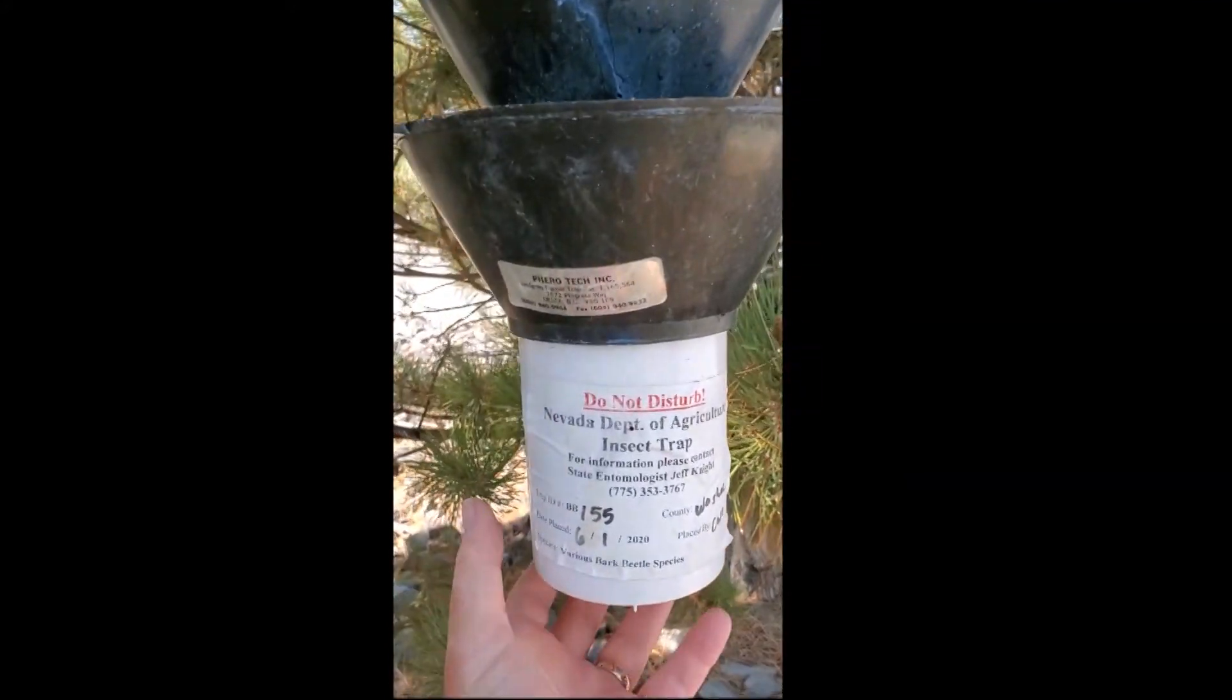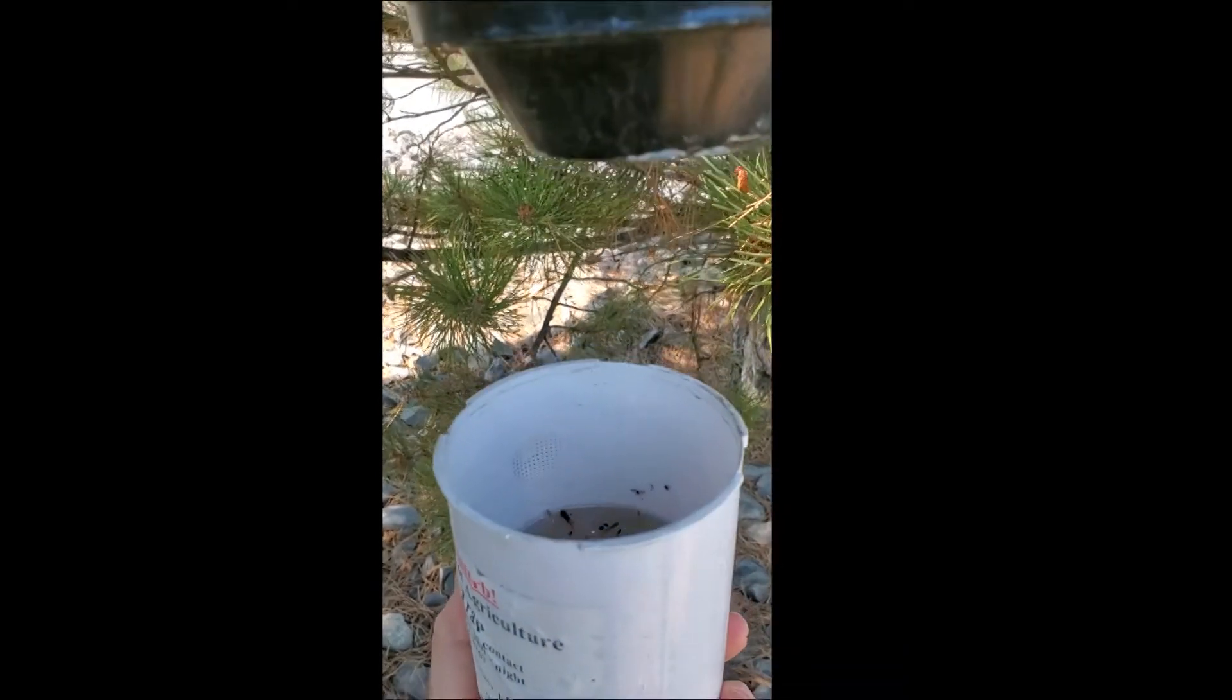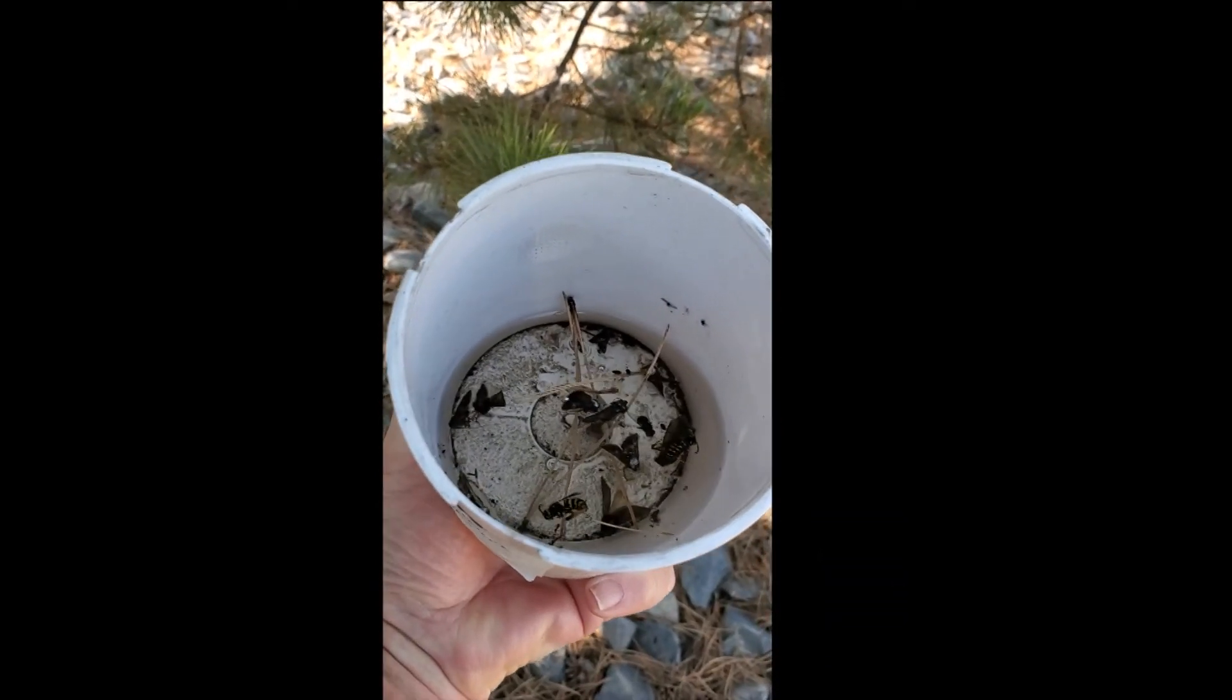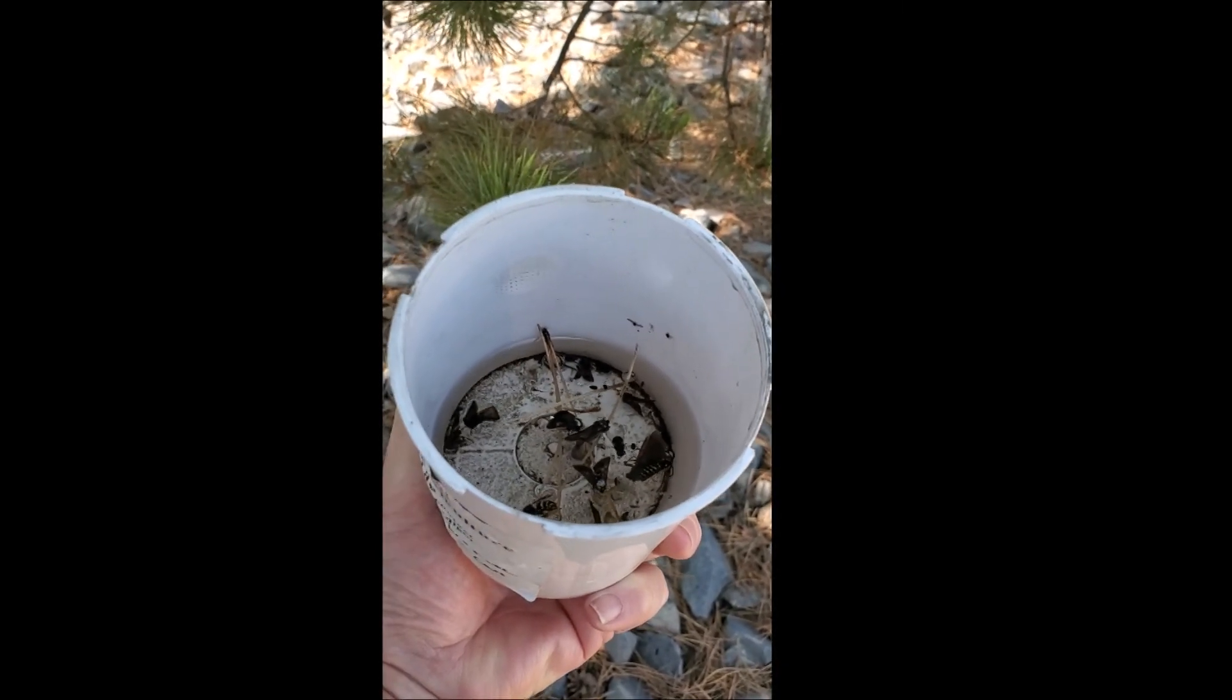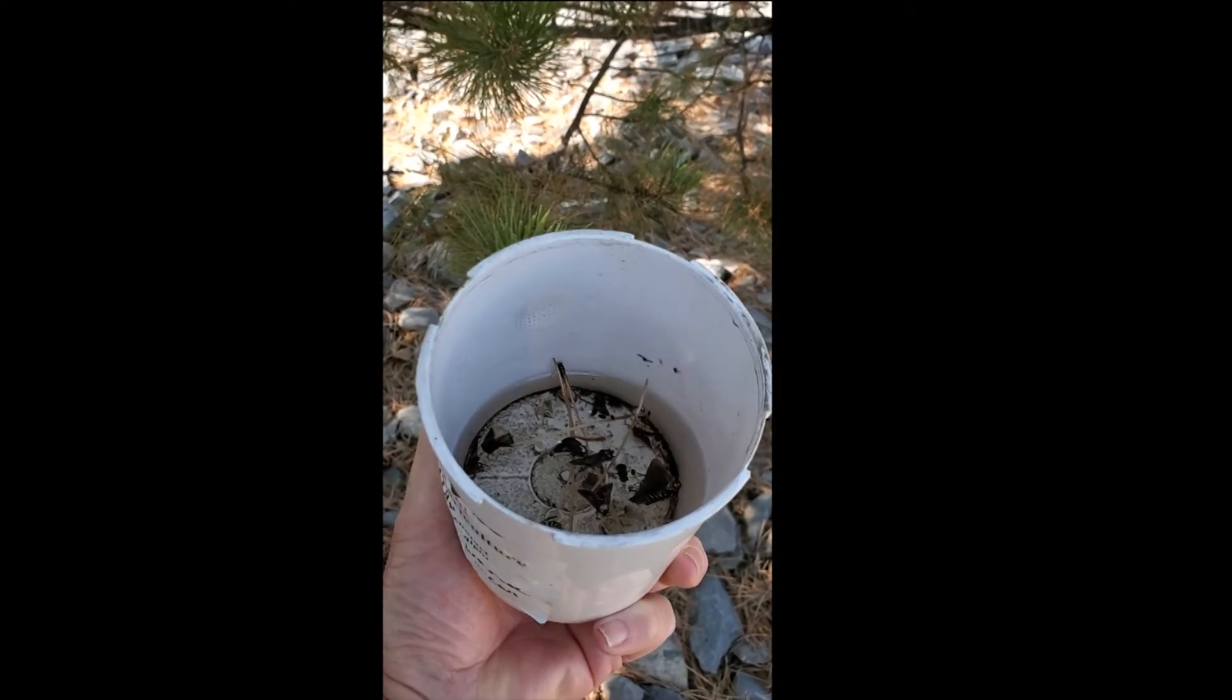We then pick the cup up about every week, look inside the collection cup. We then sift out the insects and take them in to the lab, to the collection room for identification.